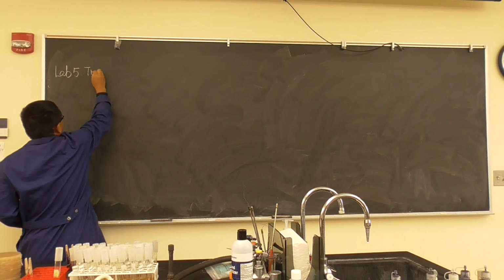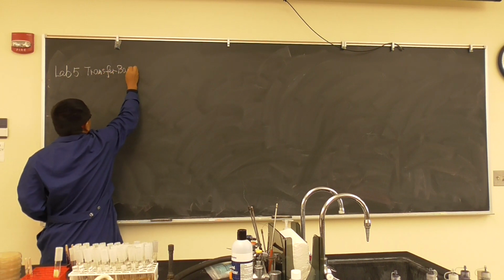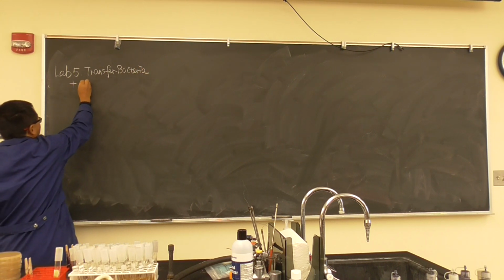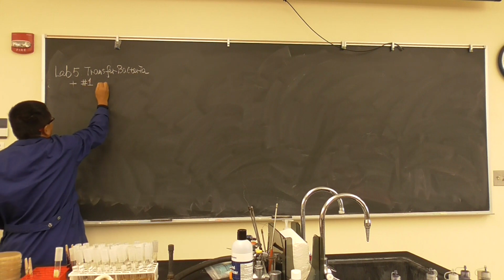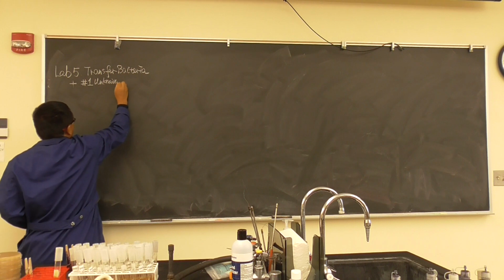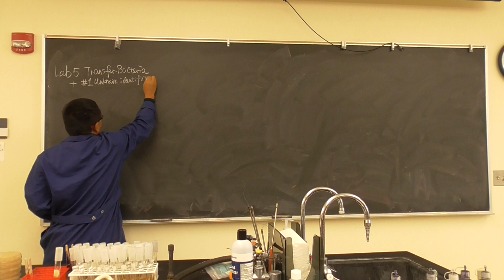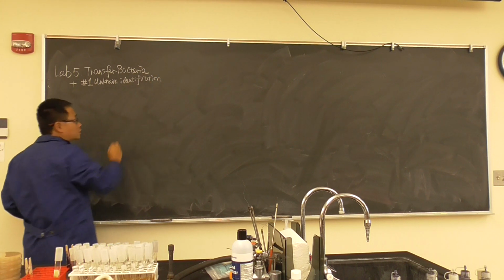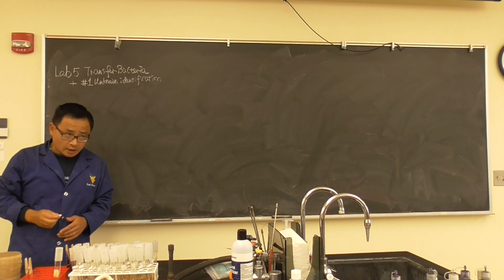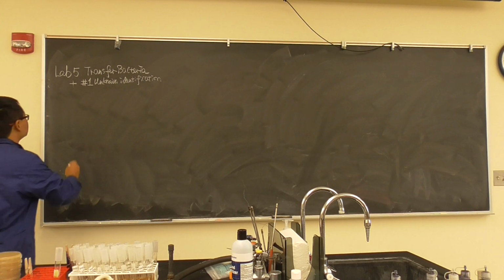I would say it is transfer bacteria. And also we will introduce you to number one, unknown identification. This will be one of the projects you work on with your bench partner to finish, and finish the report, and the due date will be 2 weeks from today. Okay, so we'll talk about that.